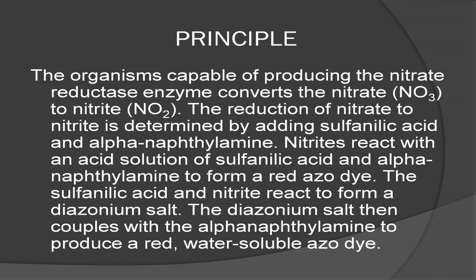If there is no red color in the medium after you have added sulfanilic acid and alpha-naphthylamine, it means only that nitrite is not present in the medium. There are two explanations if this observation occurs.